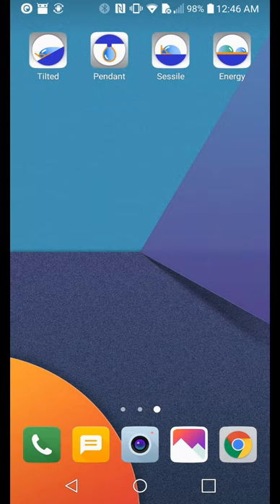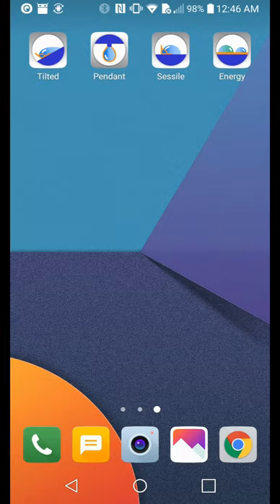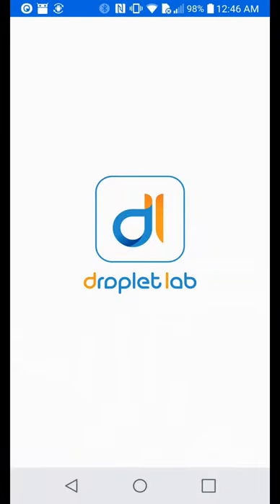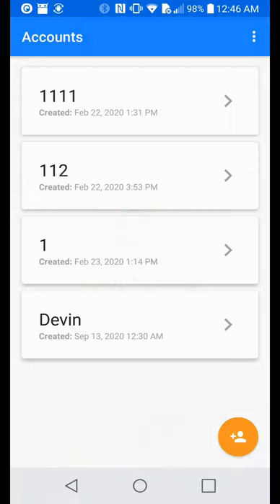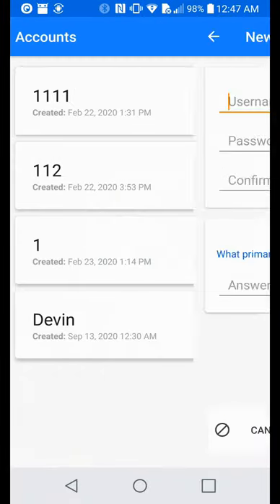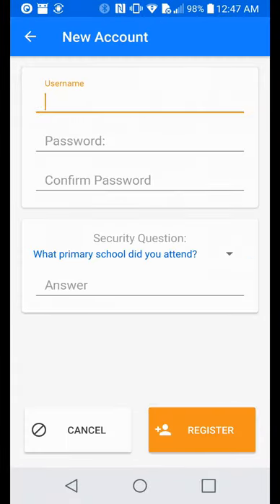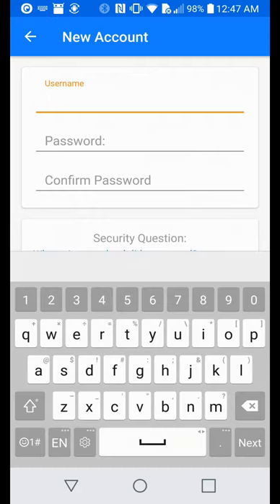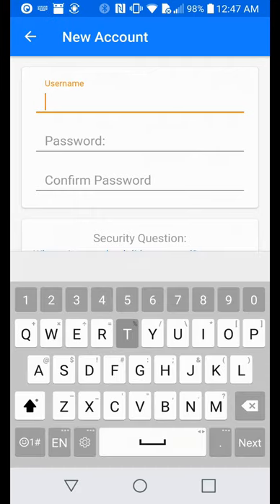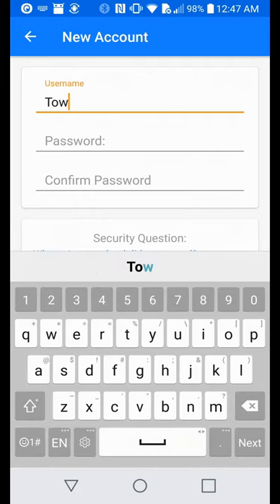To measure surface tension, we open the Pendant app. The first step is to create an account with the name, password and security question.